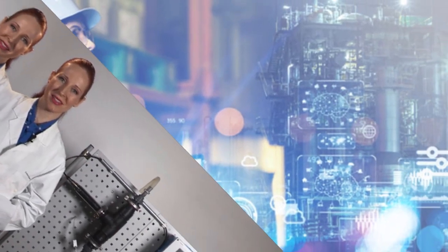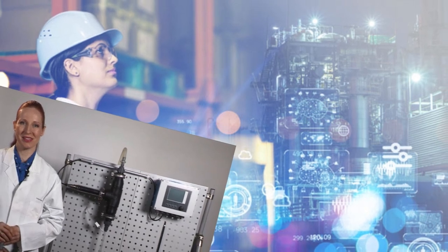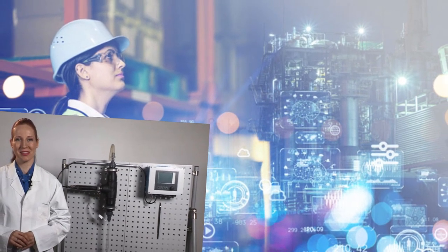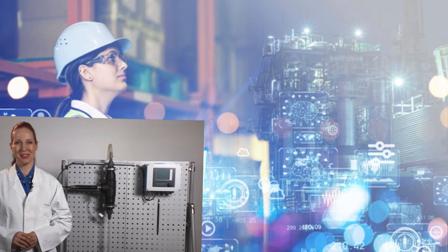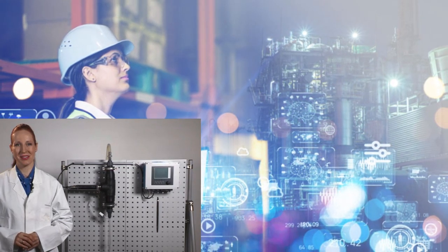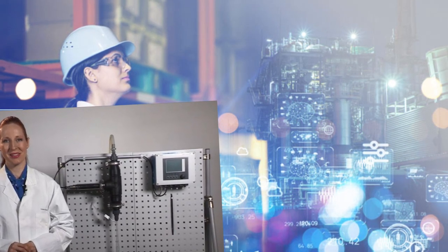Today, we're going deep on turbidity measurement. We've got a whole pile of tech specs and manuals here, so get ready. We're going to figure out how this technology keeps our drinking water safe and helps industries run smoothly, and even tells you if that swimming hole is a little too murky for a dip. It's amazing what we can learn just by shining a light through water.